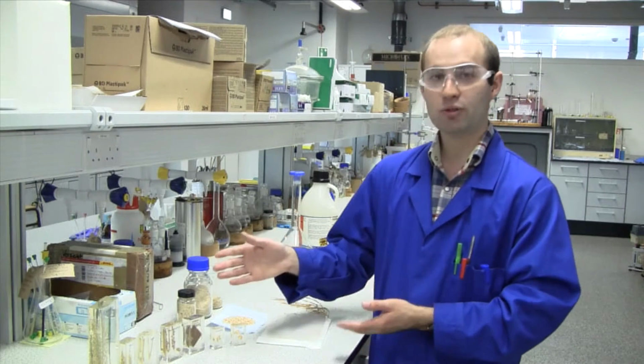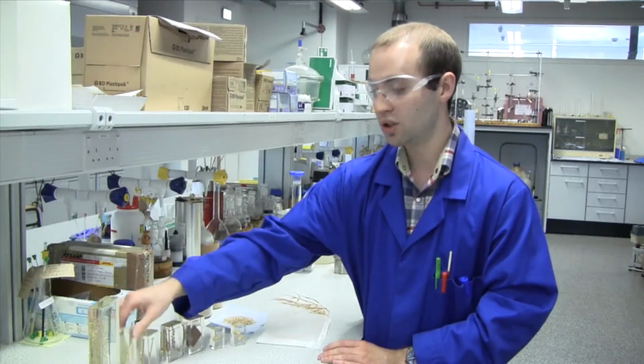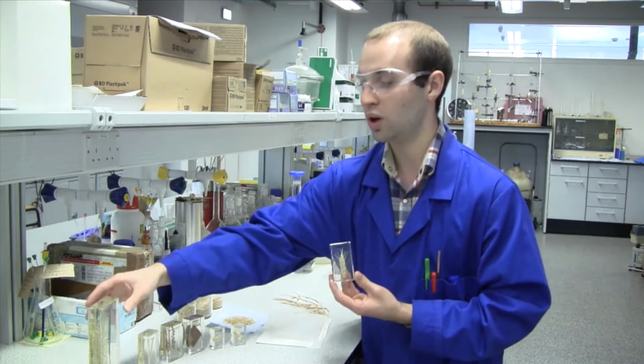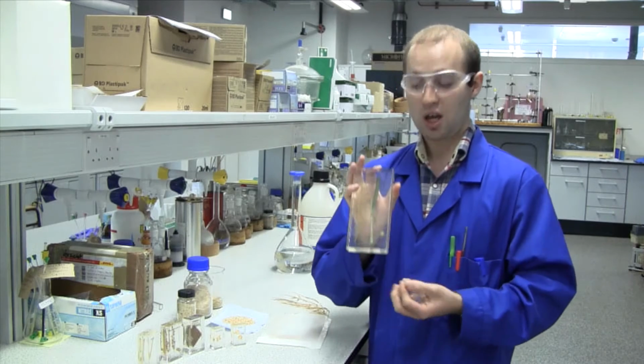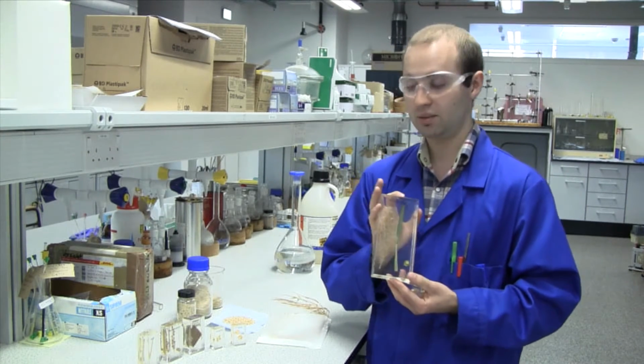The first part is plant biomass. Here in front of me we have a selection of biomass materials we can use. This ranges from common food sources like wheat to grass materials like the miscanthus. Now we want to try and avoid the food-based materials and use materials that aren't for food when it comes down to our research here.